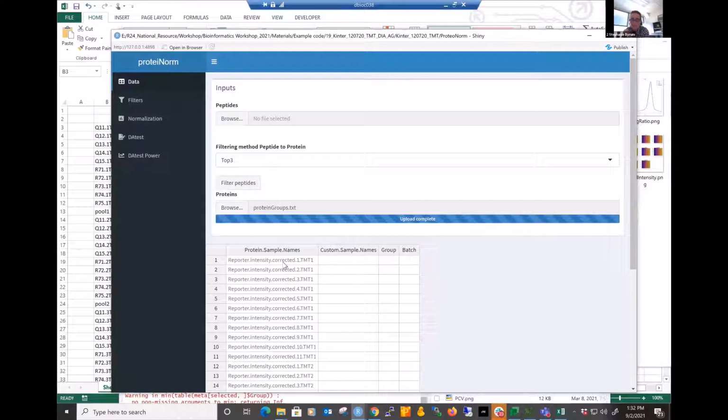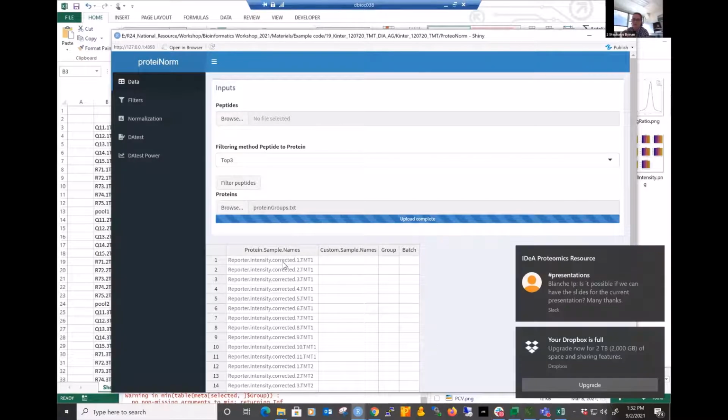The corrected has to do with the fact that you can have a little bit of shift in the spectra for the TMT reporter ions. Every single TMT kit that Thermo provides has an error correction sheet associated with that lot number. So the lot number of your TMT labels is really important. Then I can import that correction table into the database search, and it'll correct those values.